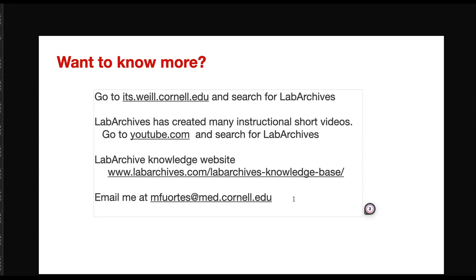And second, the Cornell policy states that every time you have a publication, every time a grant finishes, you have to archive the data in something called WIDR. And you have to upload it there if you want to use Excel. If you use LabArchives, you can just link it to the entry.